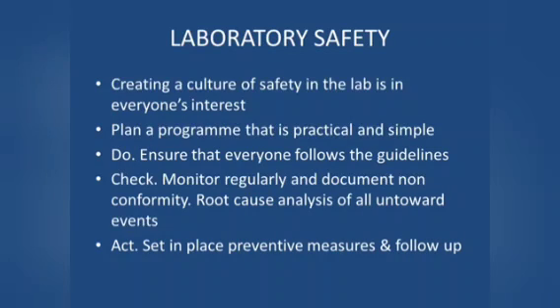So to summarize, creating a culture of safety in the laboratories is in everyone's interest. Plan a program that is practical and simple to ensure that everyone follows the guidelines. Check and monitor regularly and document non-conformity.